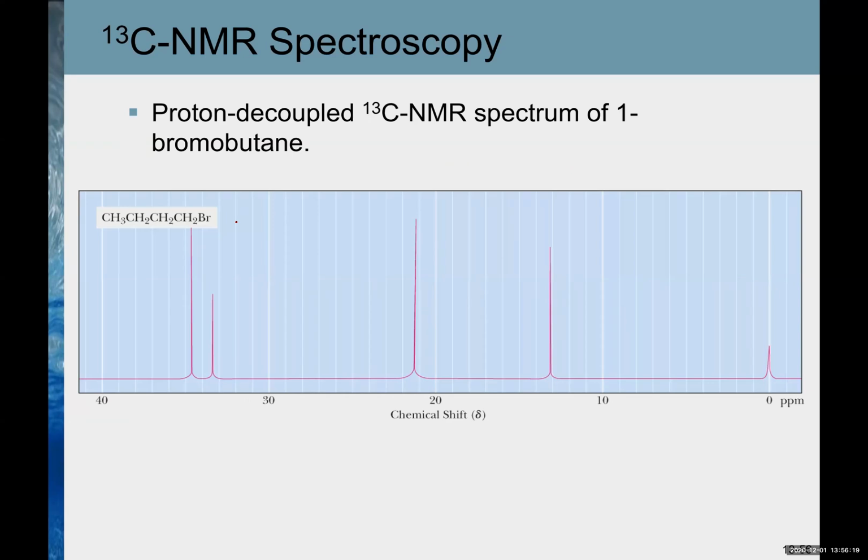And this is what a C13 spectrum looks like. It's proton decoupled, that's why none of the peaks show a splitting pattern.